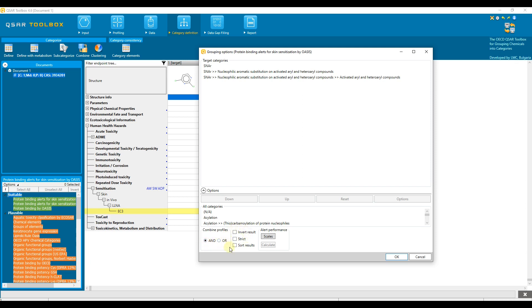The profiling result of the target chemical can also be controlled by these options here. Invert result means that all the remaining profiling results will be used to search for analogs, but not the profiling result listed here. Strict means that only the listed profile results found for the target should be present in the searched analog and no other categories.